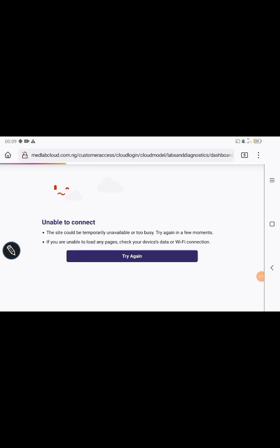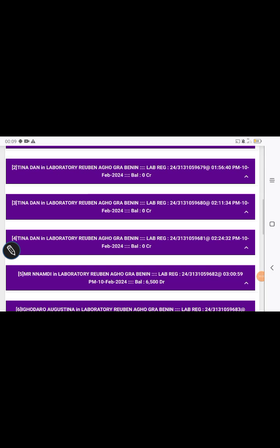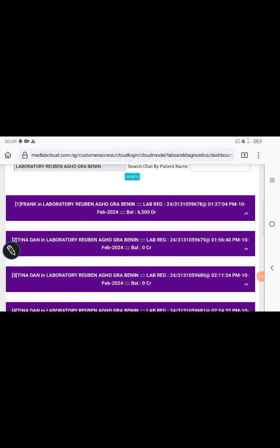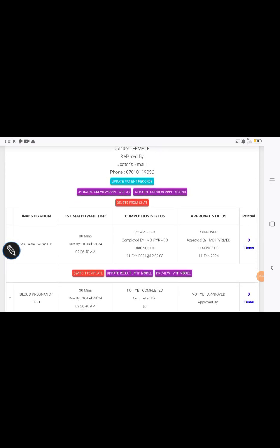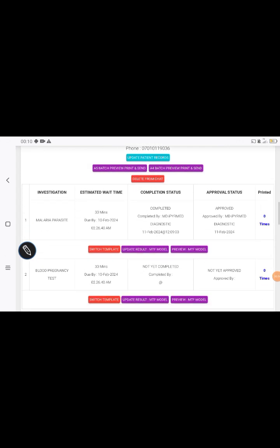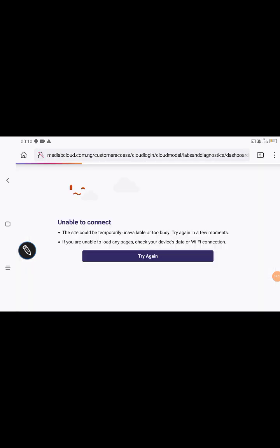Network issues. So you can go and check other investigations. The one we did just now was for Tinadan. Let's go and look at it. You see, it's showing completed now and it's showing approved. Let's go and update the blood pregnancy test as well. Update result for it.